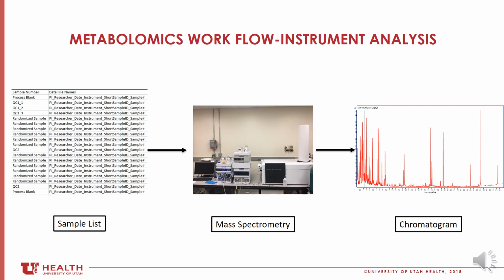I've already discussed the mass spectrometers, but this is the output that a mass spectrometer produces, the chromatogram. Now these chromatograms have a lot of peaks shown here, but it's almost extraordinarily difficult to determine if there's any real alteration in your samples just based on the chromatogram itself.